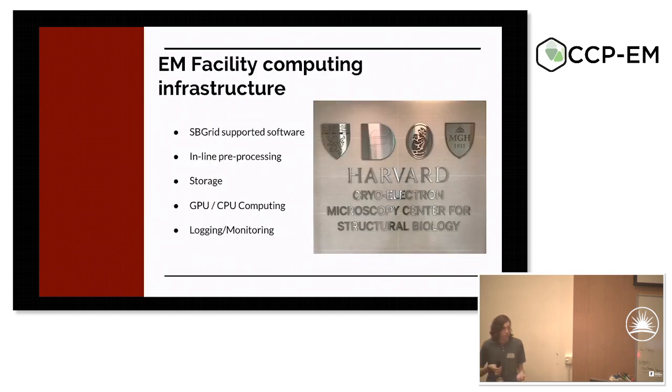So this is kind of the backbone of structural biology and computing at Harvard Medical School. So we use this software tree to underpin all of our computation. Along with that, we specialize in kind of pre-processing and inline on-the-fly pipelines, and how we tie that with our logging and monitoring tools so we can provide rapid information to our facility staff and our users at all times.